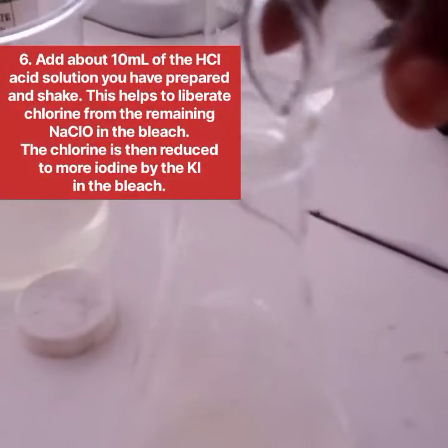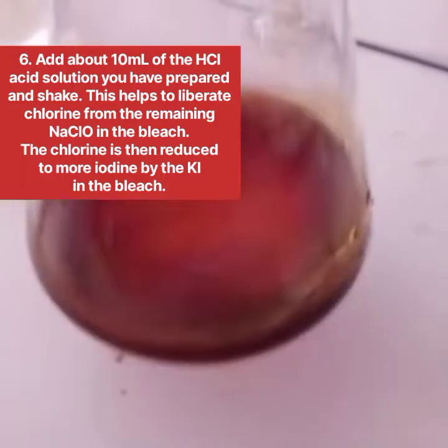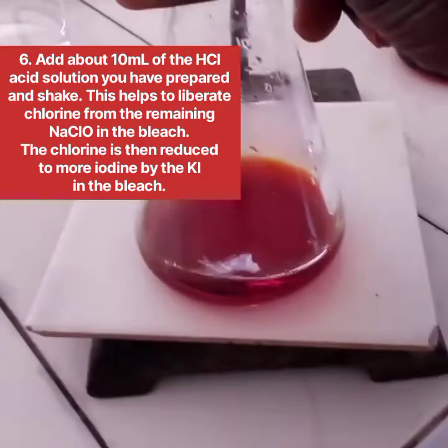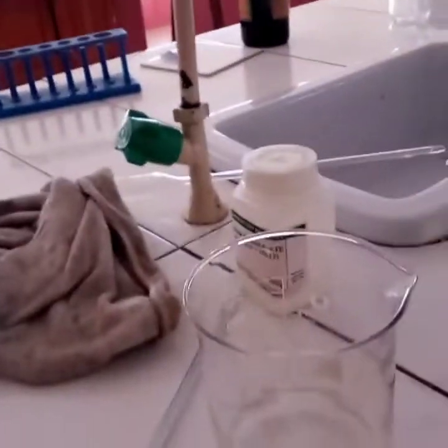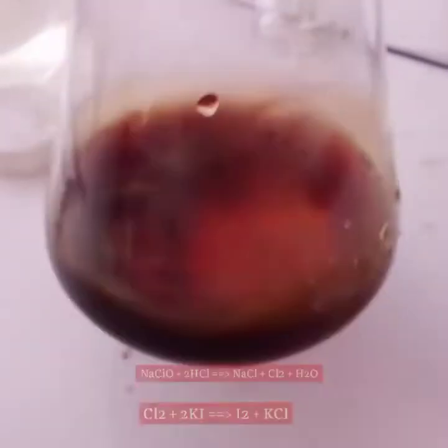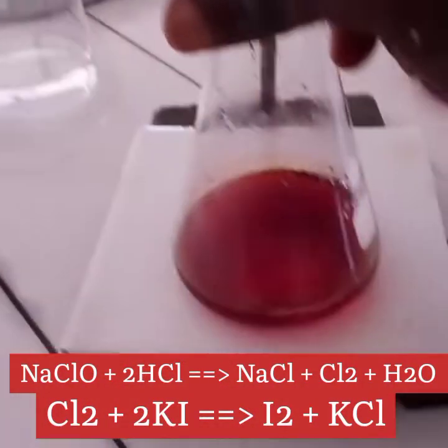Now add about 10 ml of the hydrochloric acid solution that you have prepared, and shake. This helps to liberate chlorine from the remaining sodium hypochlorite in the bleach. The liberated chlorine is then reduced to more iodine by the potassium iodide already present in the solution. The equations for these reactions are shown below.